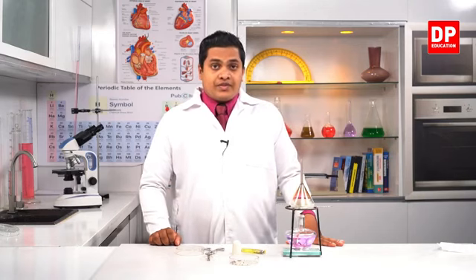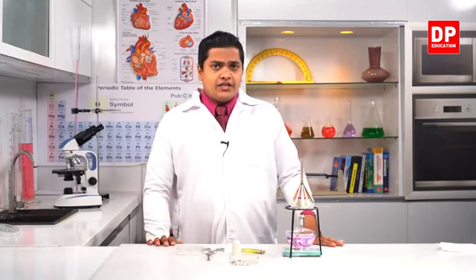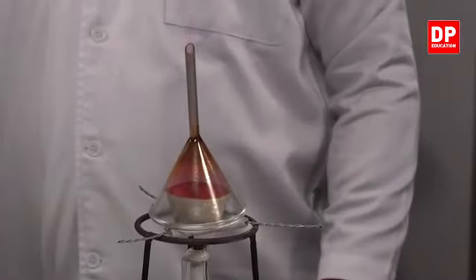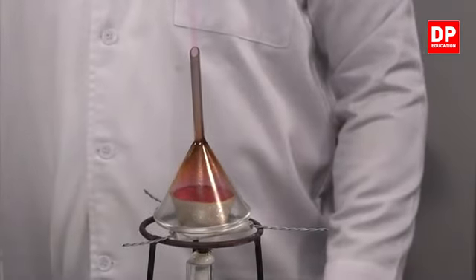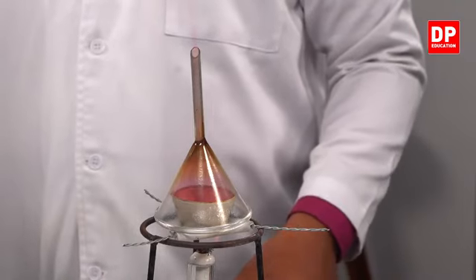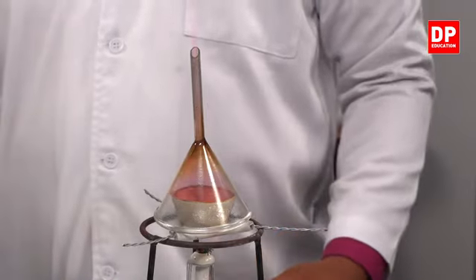So my dear children, in this state change, we can see that the iodine is directly getting converted into a gas like this, a small bit of purple gas. It's getting directly converted into a gas. We can't observe the liquid nature of iodine. There is no liquid nature in iodine. It means that when I heat these iodine crystals, it's directly converted from solid to gas. The intermediate liquid state cannot be observed, right?